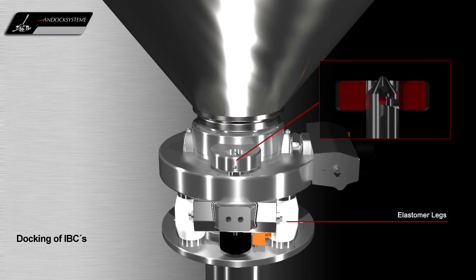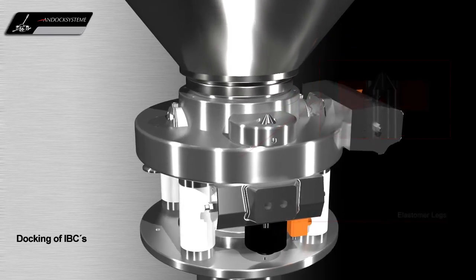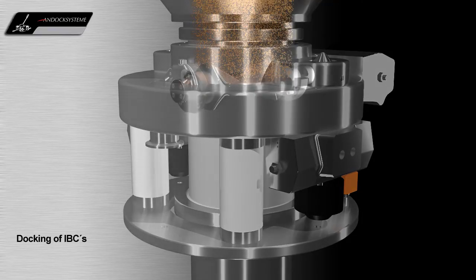The locking pins are used to align the active and the passive valves and act as a mechanical stop. Optionally, a vacuum sweep between the valve faces can be executed before the locking pins seal the active and passive valves together. After the locking procedure, the discharge process can be started.